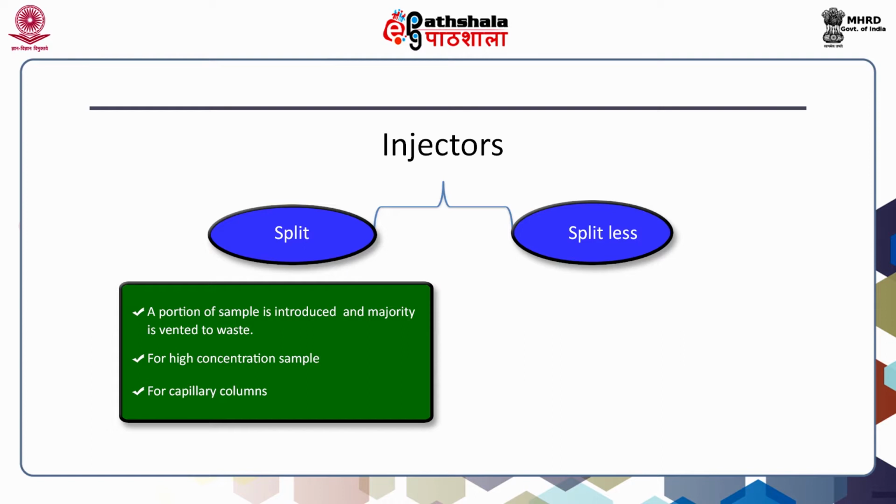So, there you can fix the ratio of the split. It can be 1/10 of the material which goes inside, it can be 1/50th of the material which will go inside, it can be the 1/100th part of the material which will go inside.